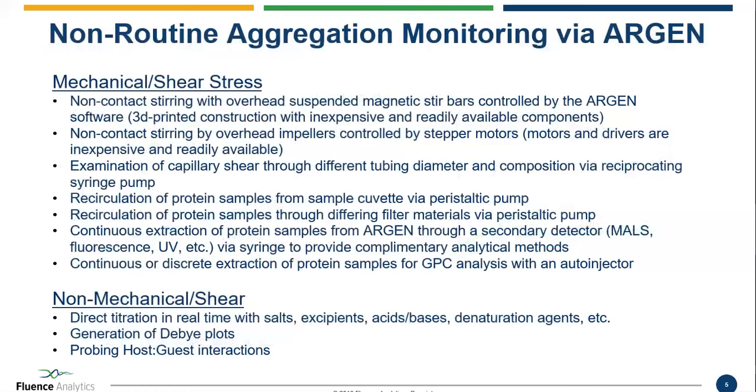And then I'm also going to cover a little bit on using either continuous or discrete extraction of materials for GPC analysis.